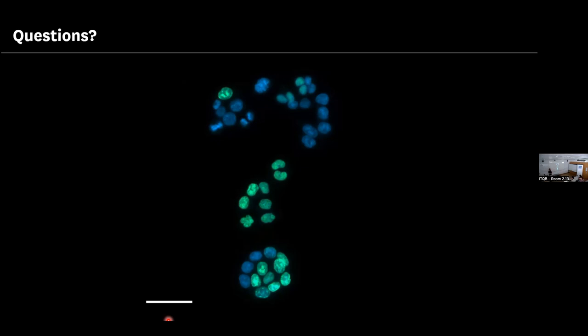But there haven't been, as far as I know, specific developments on fluorophores that would be better or optimized for multiphoton microscopy. The multiphoton laser you can tune. Ours you can tune from 680 nanometers to 1,020. So it's just finding the best wavelength, the peak wavelength to excite them. But you use the same fluorophore that you use for traditional microscopy.